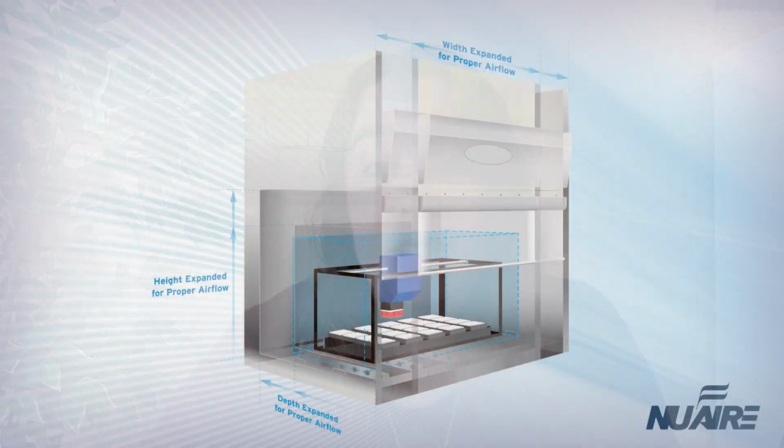Yeah, so it's again, like you said, toward that risk assessment. So we're thinking about pieces of equipment and materials that are going to be handling biological agents or biological materials, and that could generate an aerosol or a splash and potentially be hazardous to individuals. But a standard biosafety cabinet may not be big enough to fit them and their required airflow. So these are things such as cell sorters or flow cytometers, bioreactors, bioprinters, and automated liquid handling devices. These are pieces of equipment that can be rather large and require a lot of extra space that might not fit in a traditional biosafety cabinet. But if the risk assessment determines that they really need to be contained, then we need to look at something bigger, like a custom biosafety cabinet, in order to handle those pieces of equipment safely.